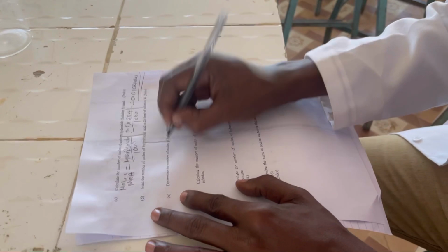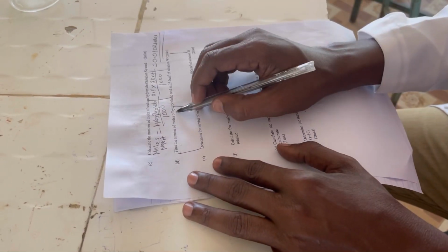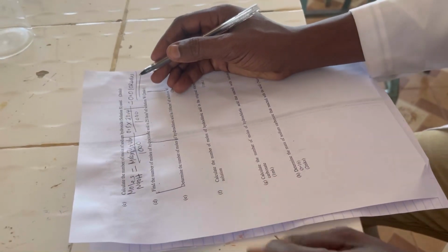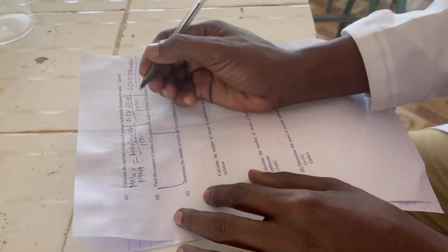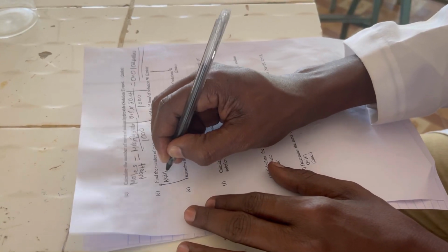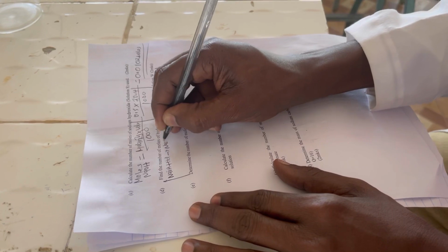Again, they are asking us to find the moles of the hydrochloric acid in 25 centimeter cube of the solution W. So now we are going to write an equation of the sodium hydroxide reacting with the hydrochloric acid to form sodium chloride plus water.